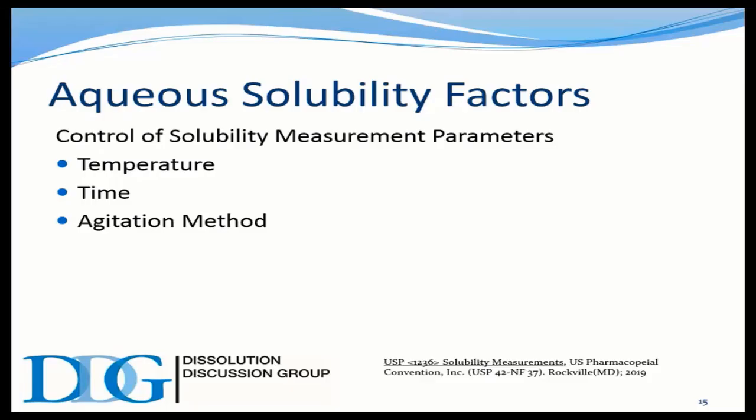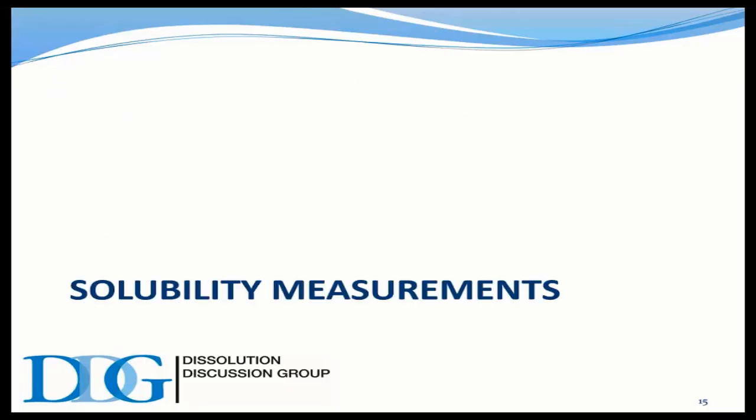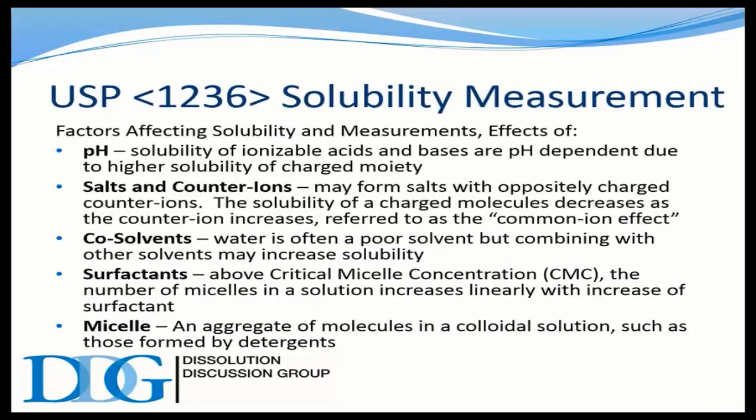And this is going to be controlling temperature, of course, allowing enough time for this to go into solution, but many things are kind of rate limited in terms of the final formulation. We don't want this thing to be dissolving forever. But then, back to the testing, the agitation method is very critical as well. So we're going to spend a few minutes looking at solubility measurement, the things that affect that.